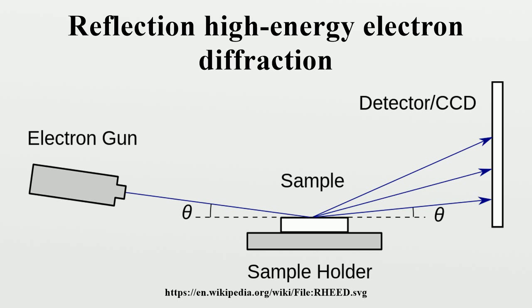Dynamic scattering analysis. The dynamically, or inelastically, scattered electrons provide several types of information about the sample as well. The brightness or intensity at a point on the detector depends on dynamic scattering, so all analysis involving the intensity must account for dynamic scattering. Some inelastically scattered electrons penetrate the bulk crystal and fulfill Bragg diffraction conditions.